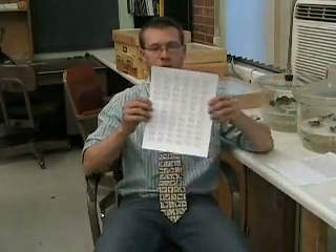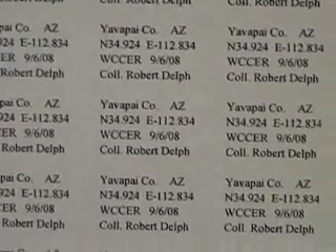For ethanol specimens in alcohol, we use acid-free, lignin-free paper. The acid-free, lignin-free paper prevents the ink from coming off in alcohol. If you try to use an ink jet, sometimes the ink will come right off the paper after it's been in ethanol for a while. For the alcohol labels, we use a label that's a little bit larger, and we use 8 font to make those labels.